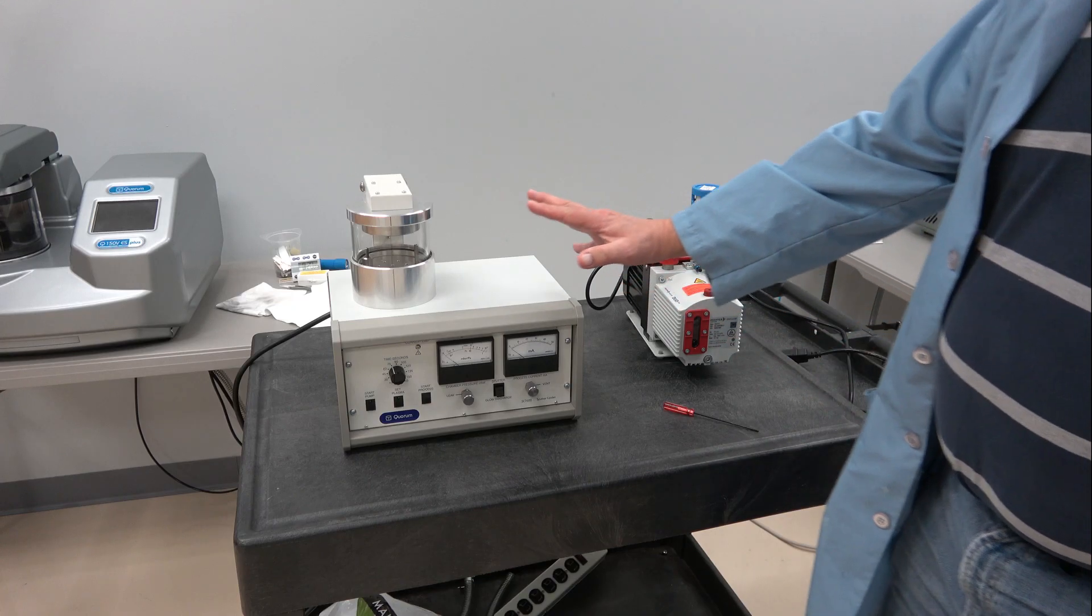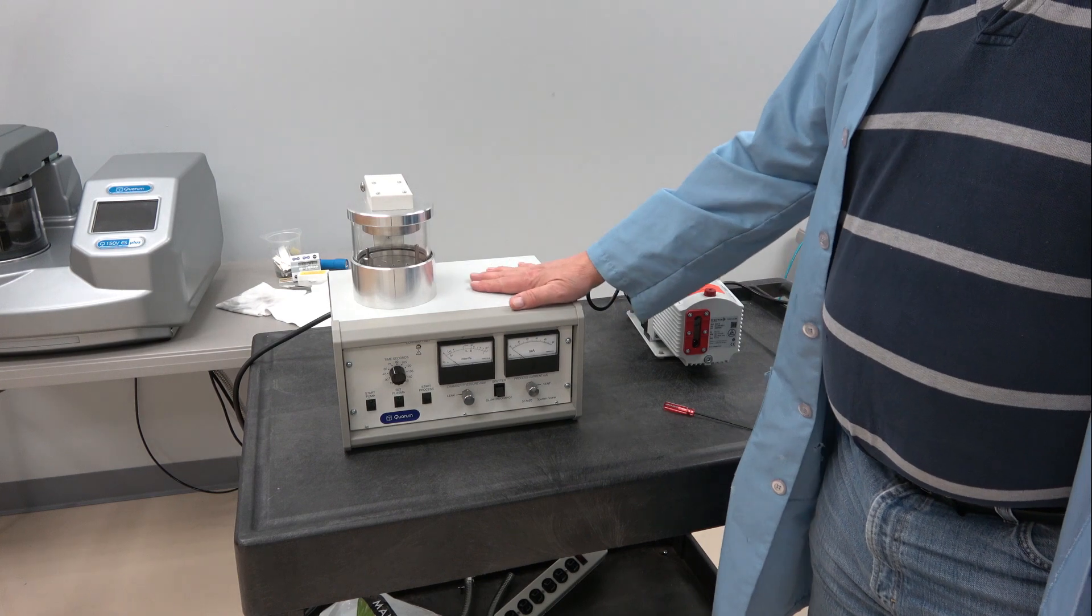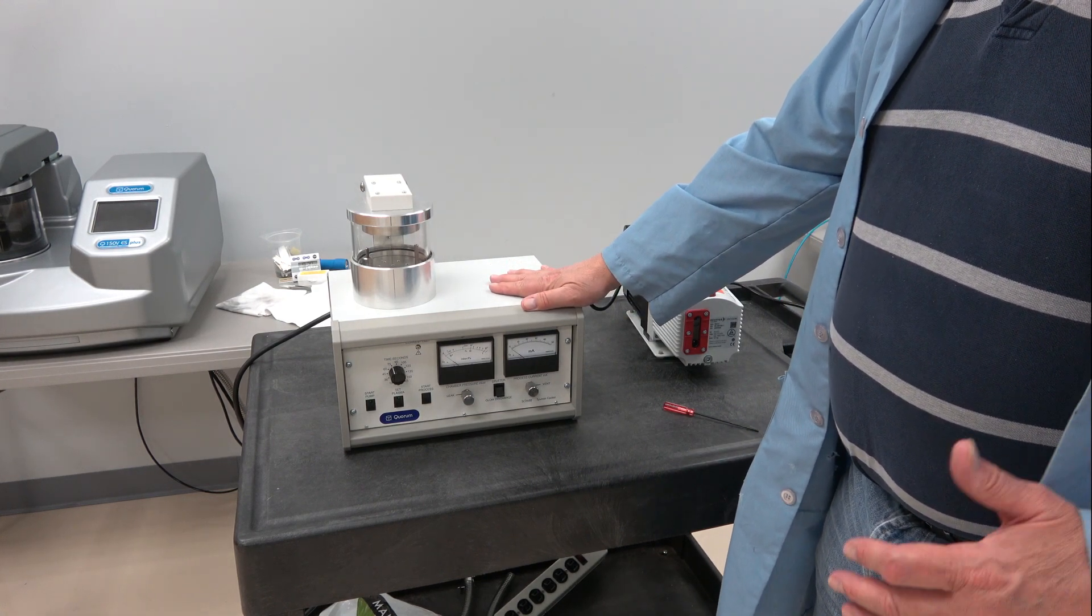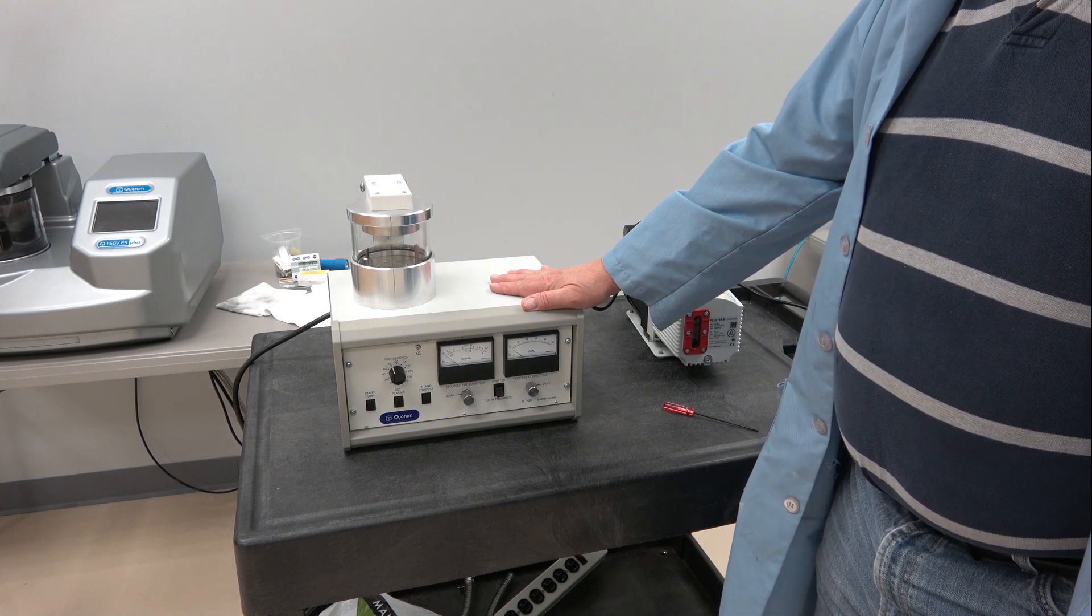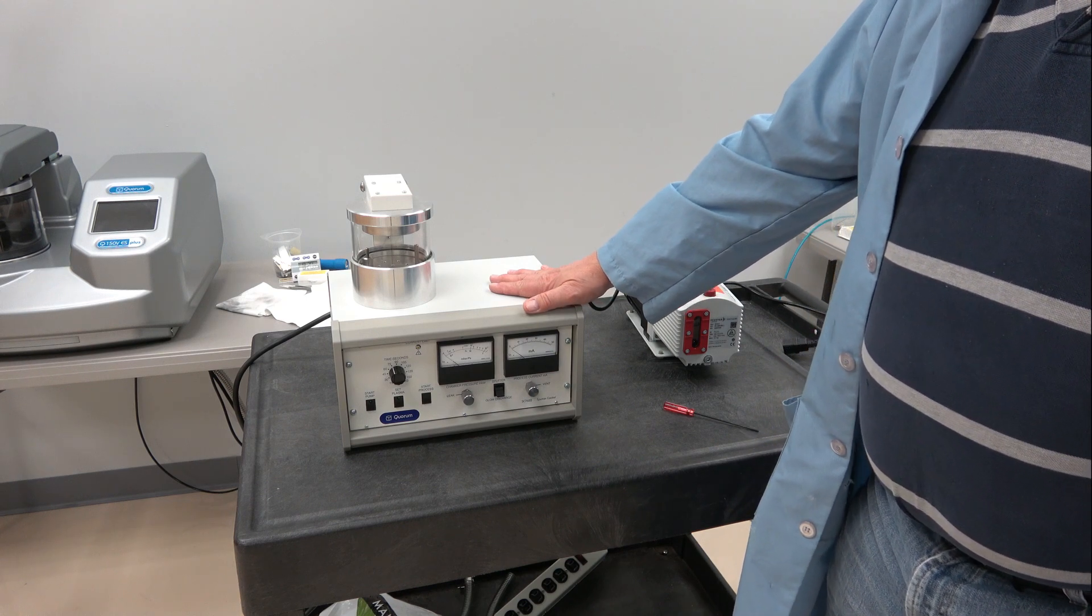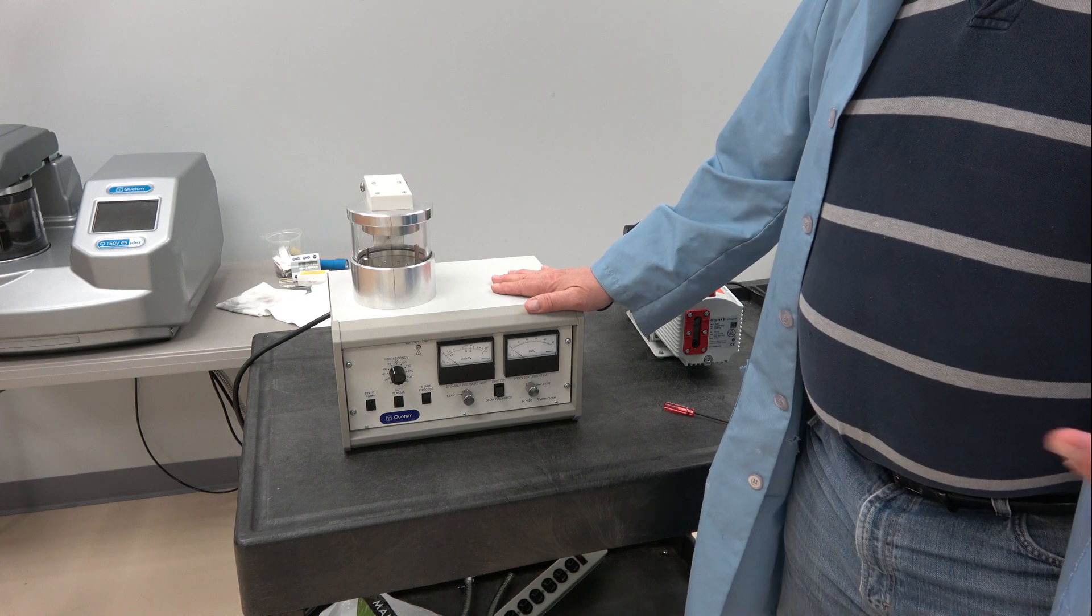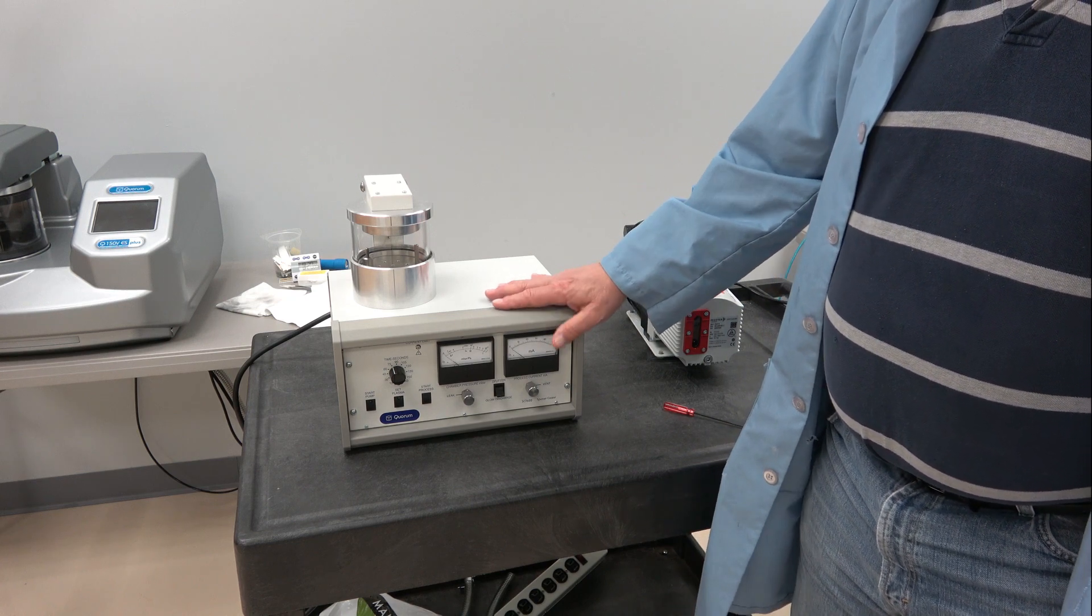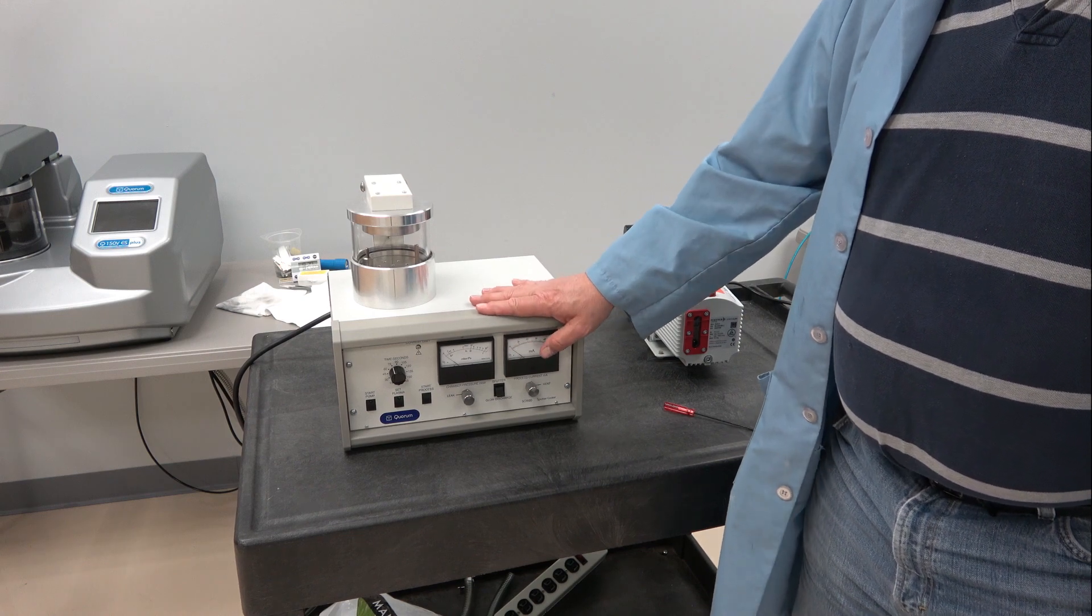So here's the SC7620. It is a somewhat primitive sputter coater, but for people just sputtering gold, gold palladium, or silver, this is all they really need. This is like 1990s technology.